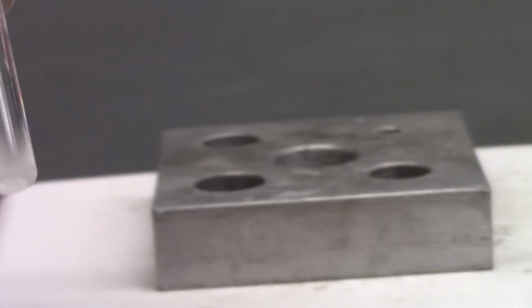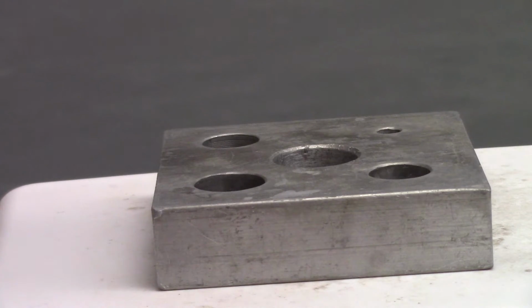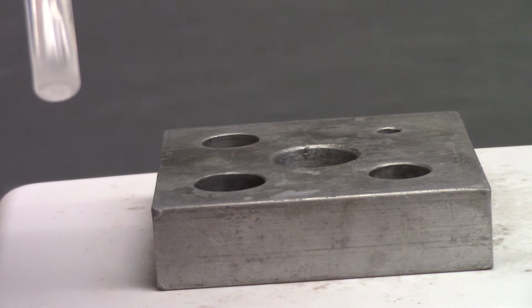I'm not sure I can get a good contrast here. There you go. Now all you've got to do is scrape some of that off for a melting point, and there's more than enough there for two or three melting points, actually. And then you're going to have to do the calculation that's in the book and the manual to figure out the purity of this stuff.